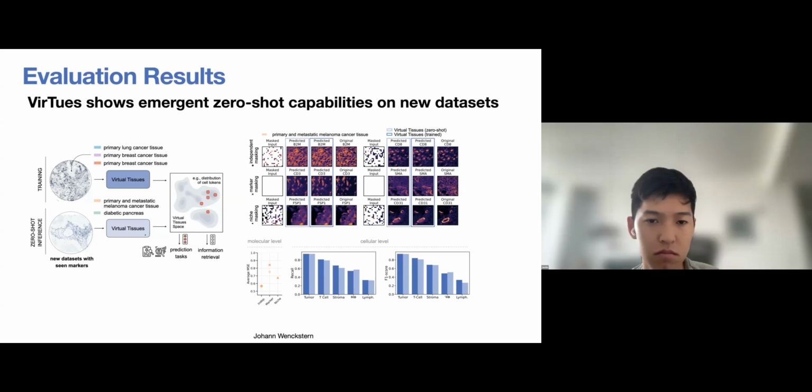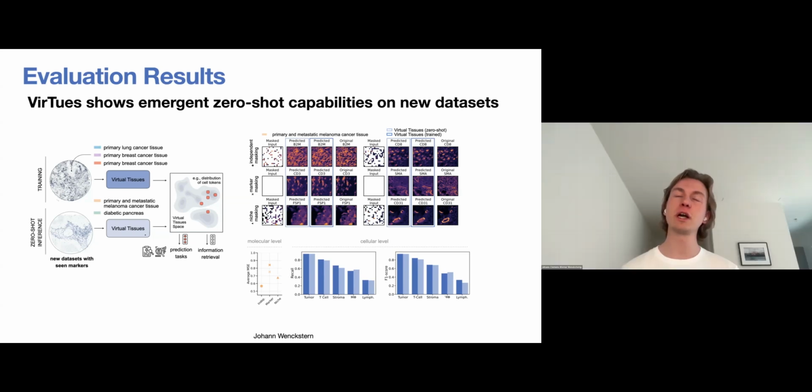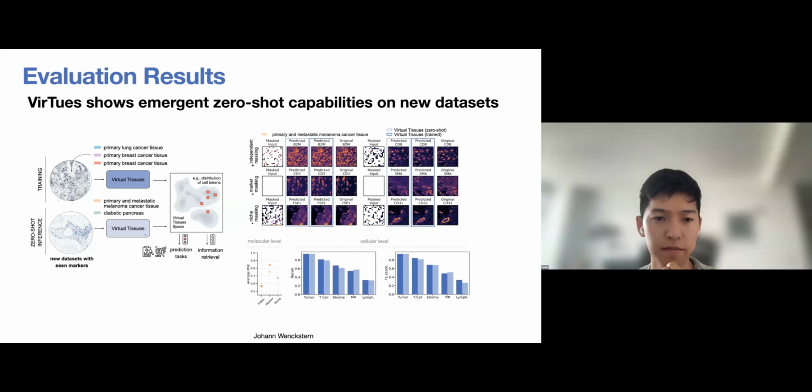I think what's interesting is that usually the reconstructions for marker masking look better than the niche masking, because the niche does get a bit blurry. The marker does not, which I believe lies in the fact that in the marker masking, it does very well on the relative prediction, but it can shift in the absolute value it predicts on the absolute base level. I see.